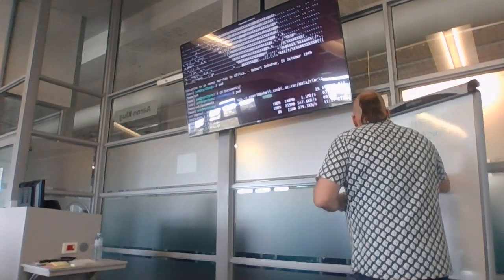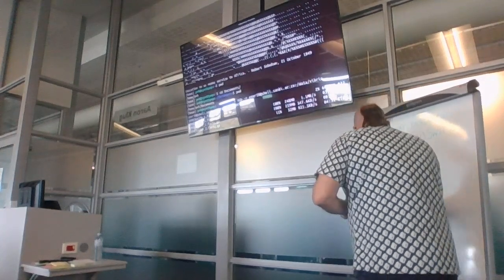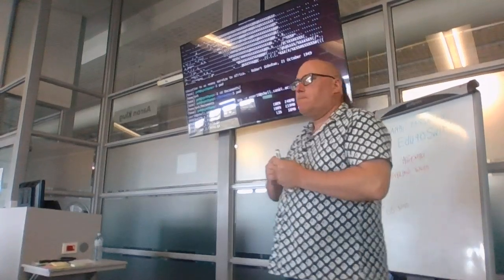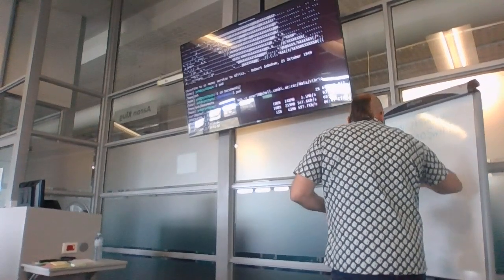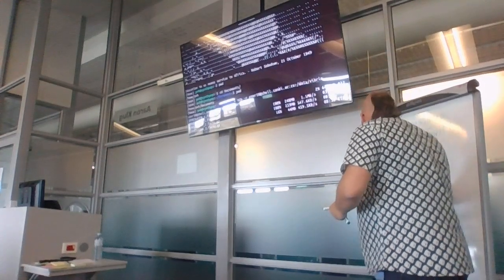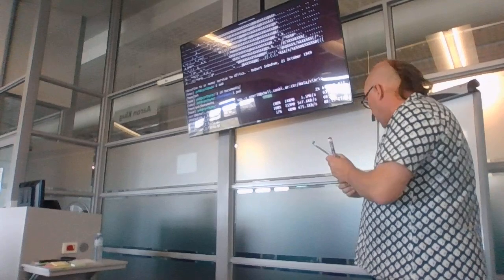But is it reference-based, or is it de novo? Okay? And when we say reference-based, then what we mean is that we're going to choose a reference and then we're going to map reads to it with read mapping, and then we're going to call variants here, okay?